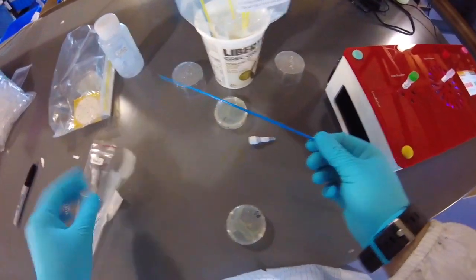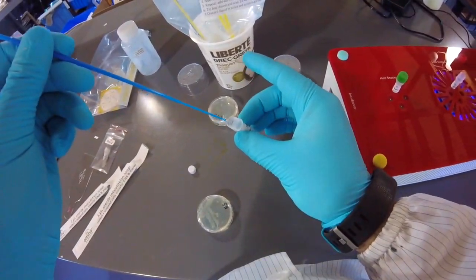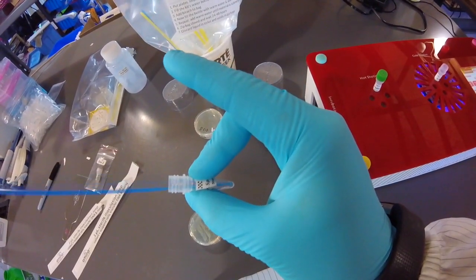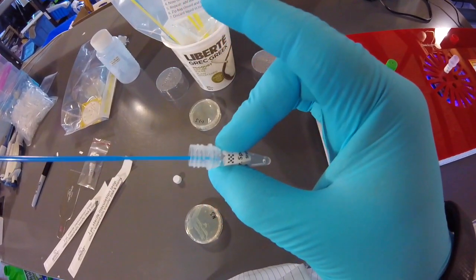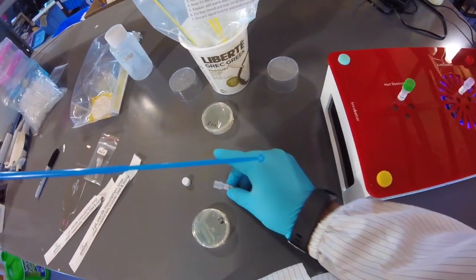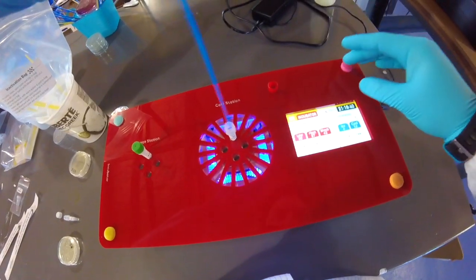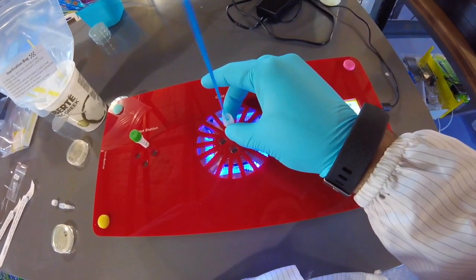All right, the next step is getting DNA. This is really straightforward. You're just going to dip your loop into the liquid at the bottom. Just spin it around so that the center of the loop fills with the DNA that's inside that liquid. If you have a look right in the little loop end, you can see the light distort a little bit. That means the liquid's in the middle. I'm just going to go back and put it in and mix it for about 10 seconds. And I'm going to reset my timer here because now I'm going to let that sit for about 5 minutes.